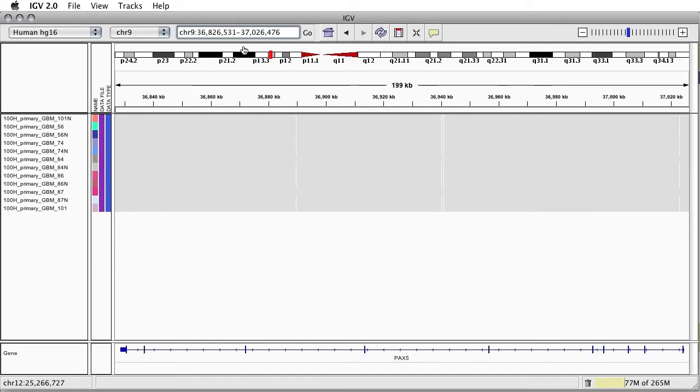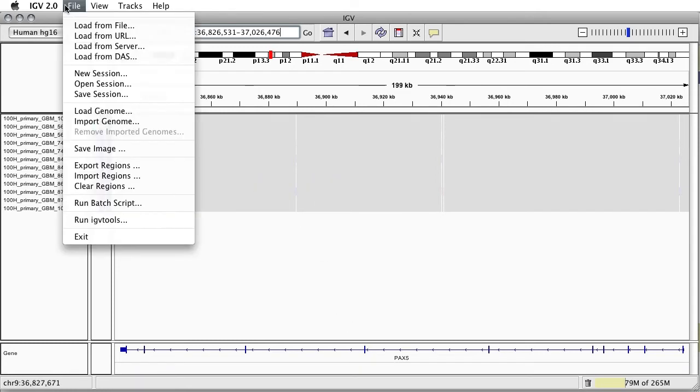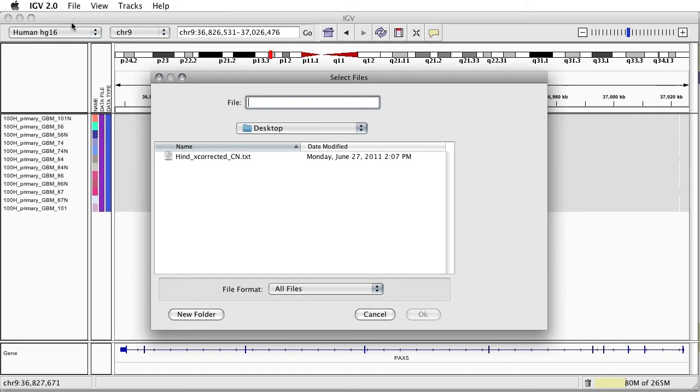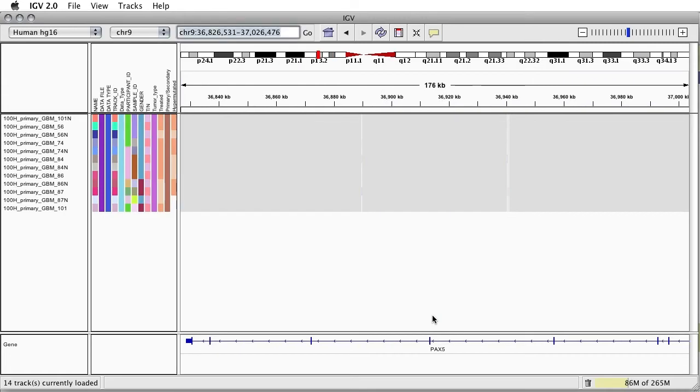To load additional datasets, such as a sample information file, we select Load from File in the File menu and select our files. Here we will load a sample information file to fill out the Attributes column. Note that this is how you would also load any other datasets associated with your data and saved on your local or networked drive.